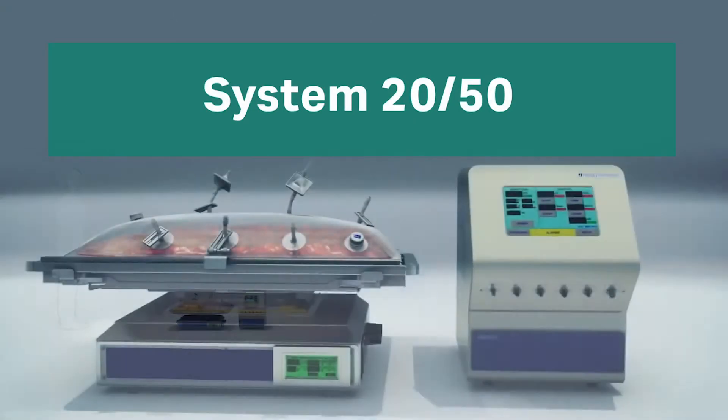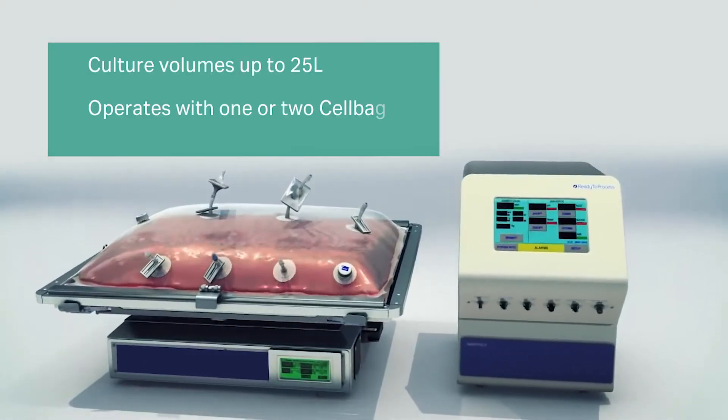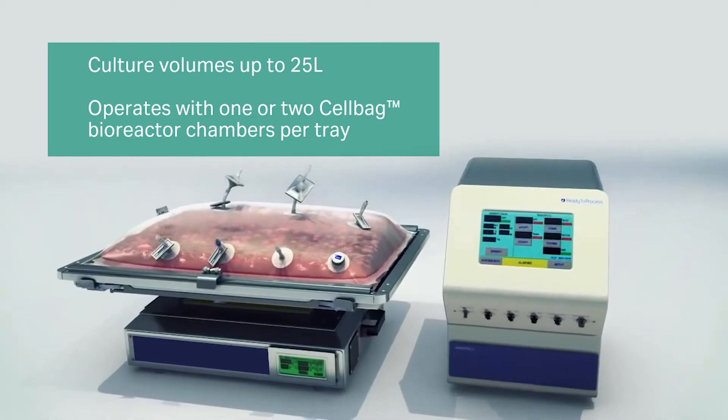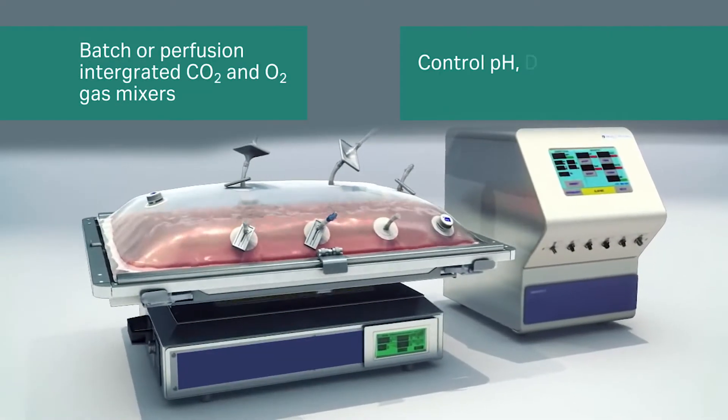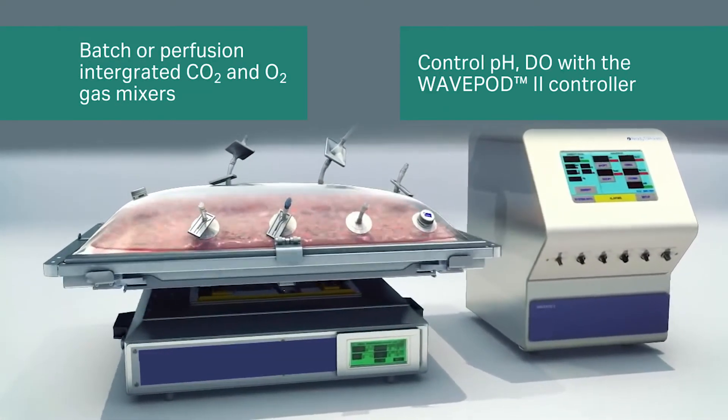The System 2050 is the workhorse of the Wave product line. This popular bioreactor provides flexibility — different trays may be attached, allowing for culture volumes up to 25 liters. Perfusion capabilities are available with externally connected pumps.